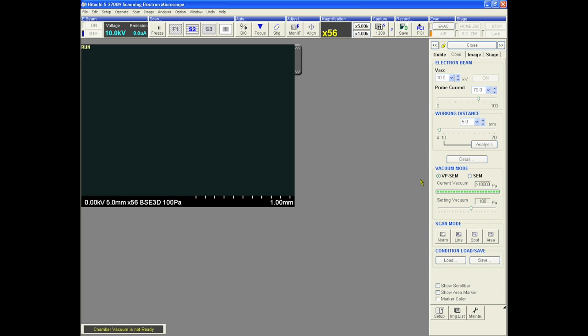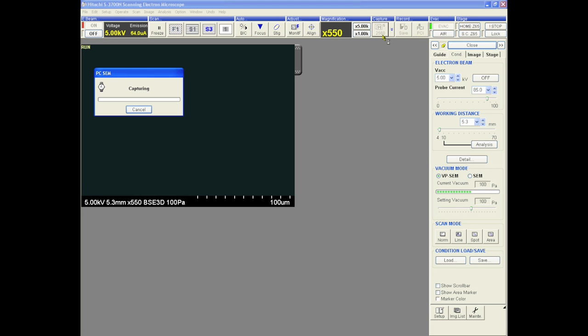Once the chamber is pumped down to the appropriate vacuum level, click the high voltage button to apply voltage and begin viewing your sample. If no current is displayed when a voltage is applied, the filament is burned out and will need to be replaced. Please contact the trainer so the proper steps can be taken.